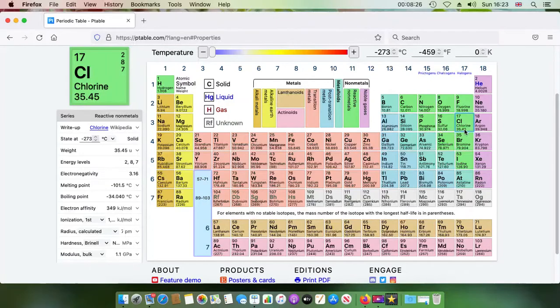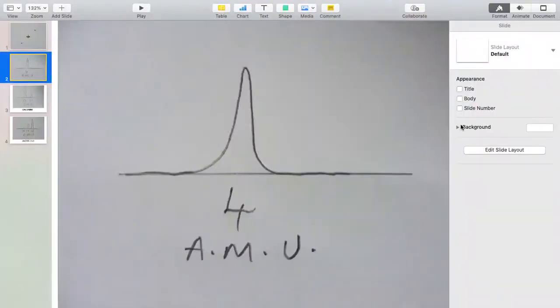It didn't have an integer weight, and how could it be that it didn't have an integer number of protons and neutrons? Well, if in those days people had mass spectrometers, they would have understood more easily what was going on. It was worked out in the end, and if I show you a mass spectrum of chlorine, it's like this.